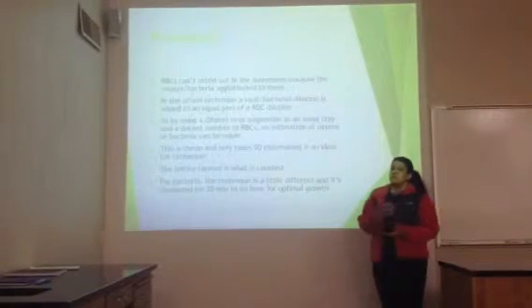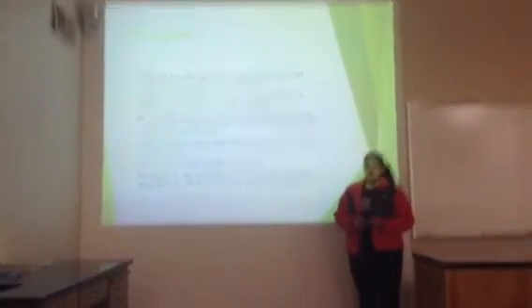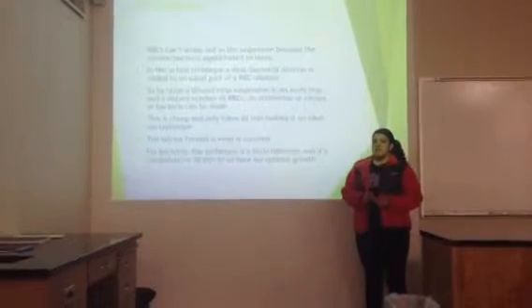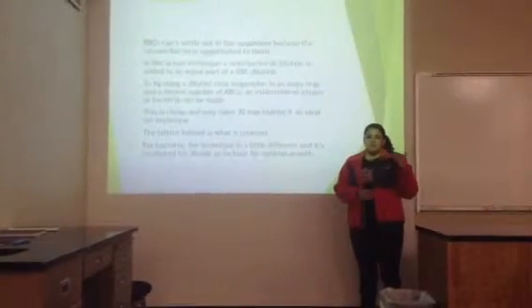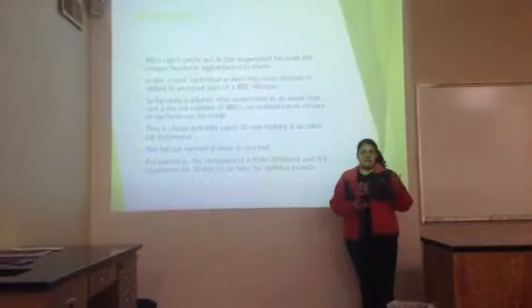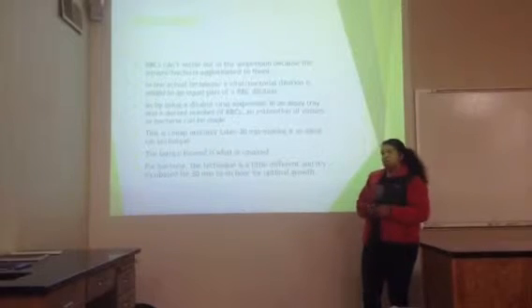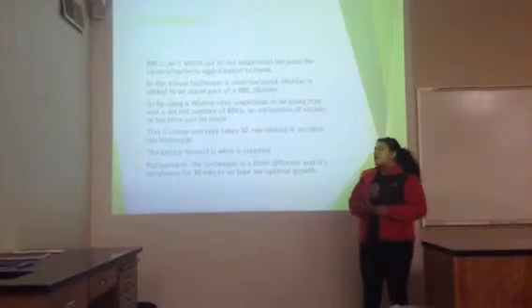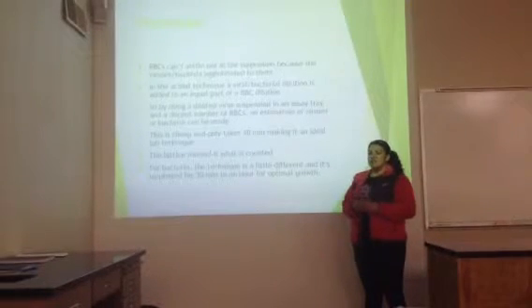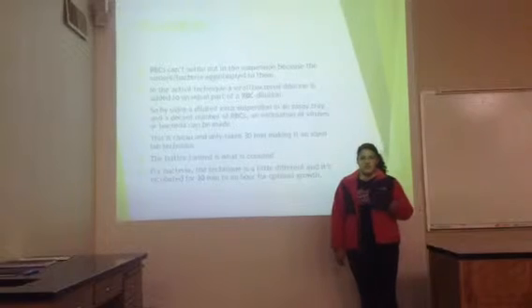So usually it's an equal amount of viral or bacterial dilution to red blood cell dilution, and it gives a good estimation, well, not necessarily of how many, but of the presence of viruses or bacteria. It's cheap, it only takes 30 minutes, and it's an ideal lab technique, like I said. The lattice is what's counted. Like I showed in the previous slide, if there's darkening, you can tell there's a presence of viruses or bacteria.